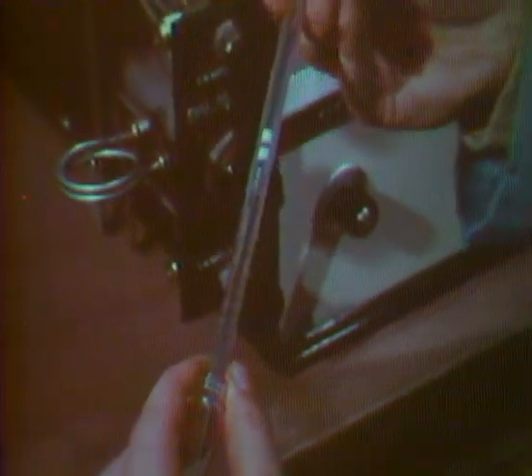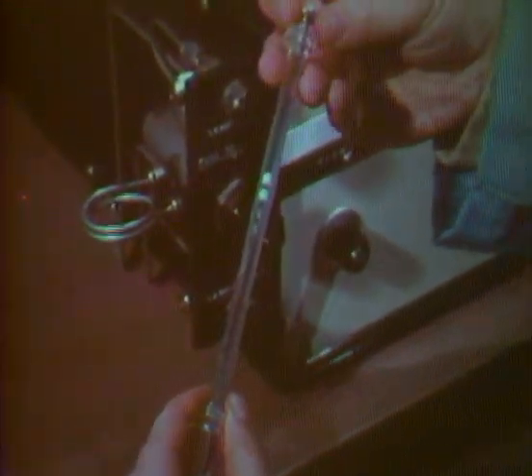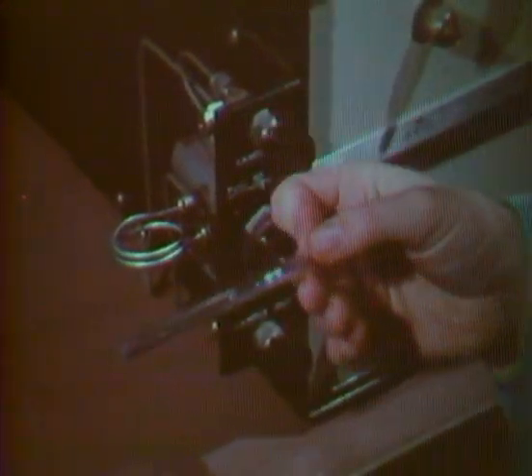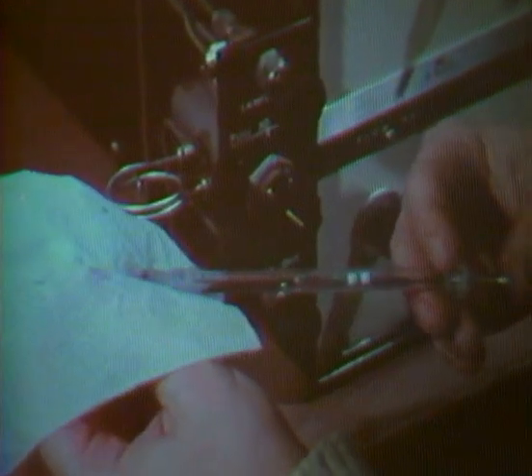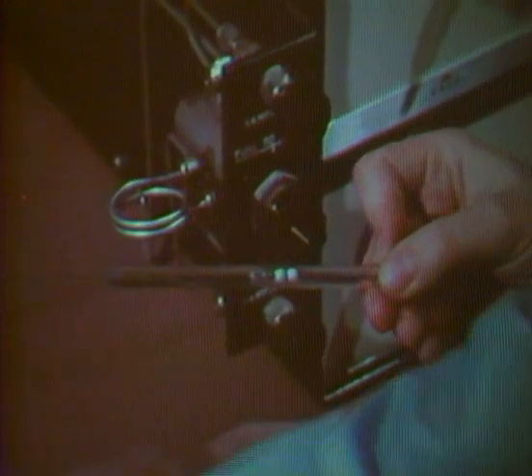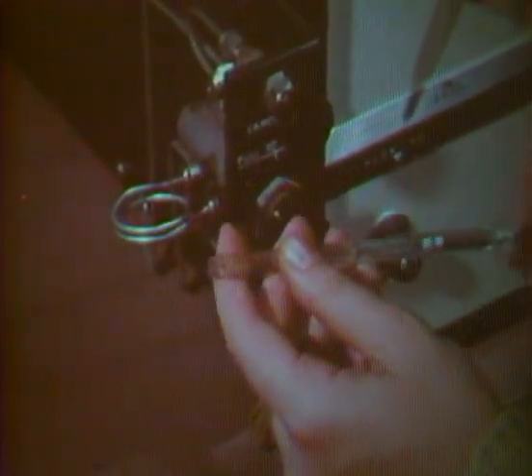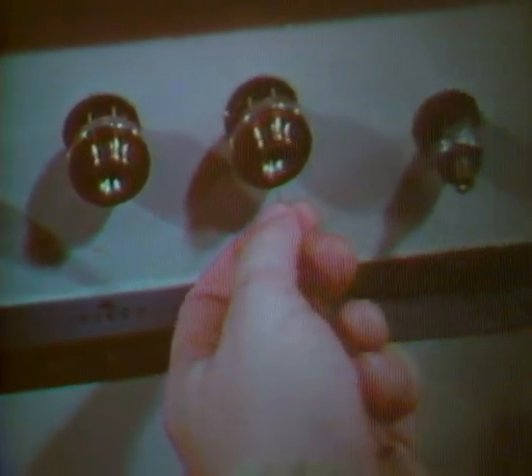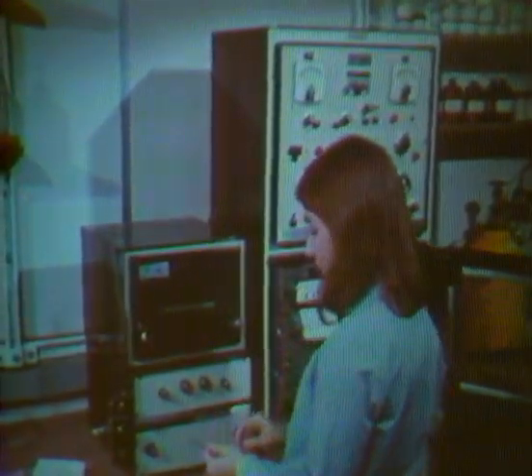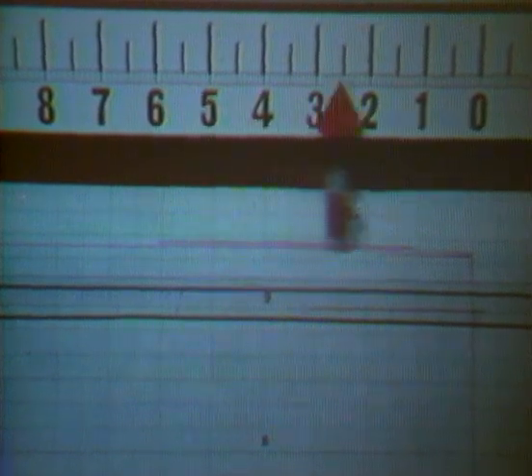The chromatographic techniques can also be divided according to the nature of the mobile phase. The most popular technique is gas chromatography, abbreviated as GC. Today, over 80,000 units are in use worldwide. The popularity of GC is due primarily to its simplicity, great resolving power, and sensitivity. Let us examine the parts of a gas chromatograph and understand why it works so well.